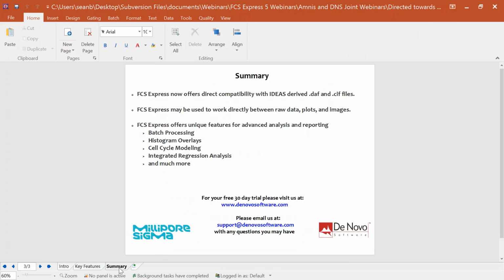So with that, I just wanted to summarize a little bit what we talked about in FCS Express today. Again, we're very happy to be working with the team at Amnis to offer this direct compatibility with DAF and CIF files. This is really a big thing for anybody who is used to using software outside of IDEAS or wanted something outside of IDEAS for doing some more advanced things like batch processing, easy to use histogram overlays, cell cycle modeling, this integrated regression analysis, and a lot of the other things that we offer in FCS Express, which are really quite unique to us.